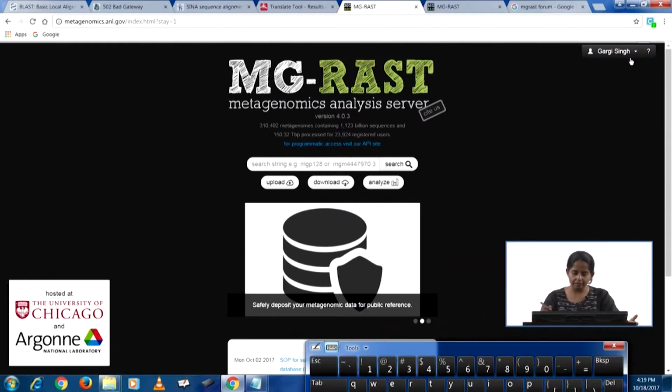Alrighty, so if you are watching it now, you know the difference between high throughput amplicon sequencing and whole genome sequencing. In high throughput amplicon sequencing, we have a lot of errors, and a lot of chimeras may come up, so we require a dedicated tool to analyze it for us and then give us the meaningful data.